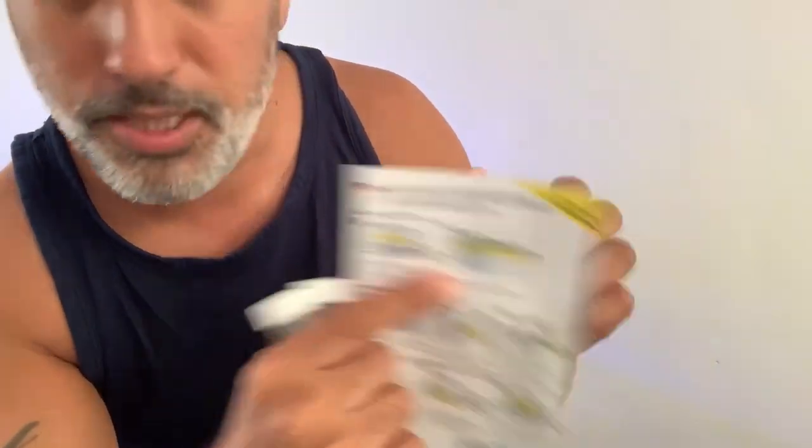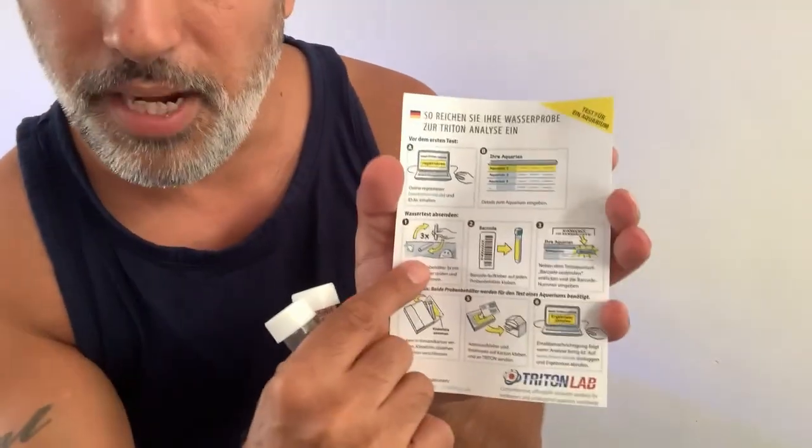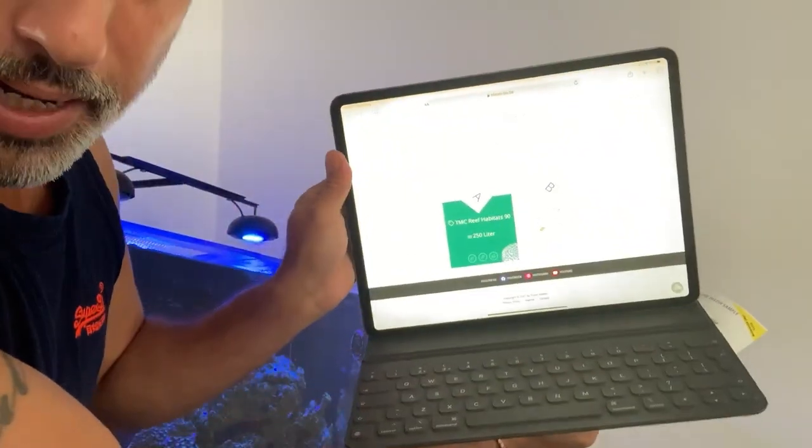I've done all of that before. You go on to Triton — I've got the iPad just over there — and then you select the aquarium. If you've got multiple aquariums, you fill up with water and stick a barcode on it. The barcodes are here, so we stick that on there and then register the barcode on to the app on my iPad.